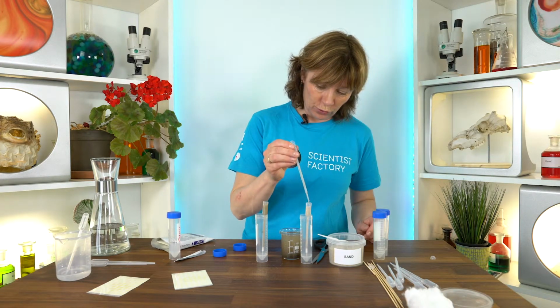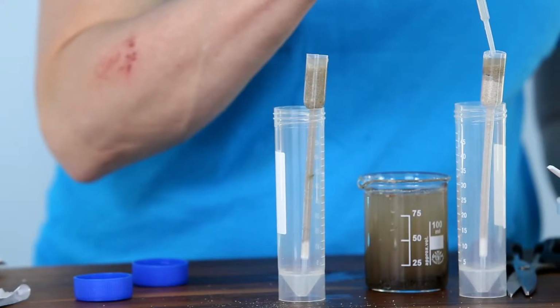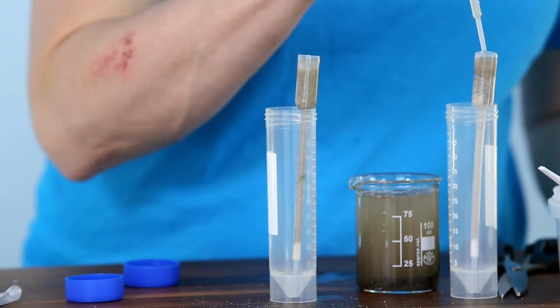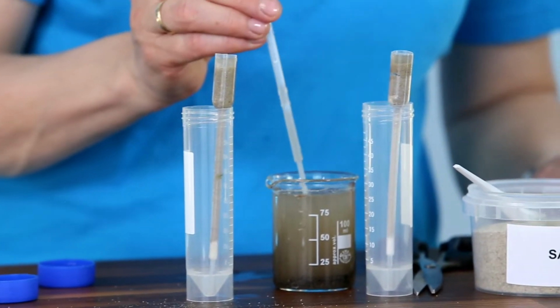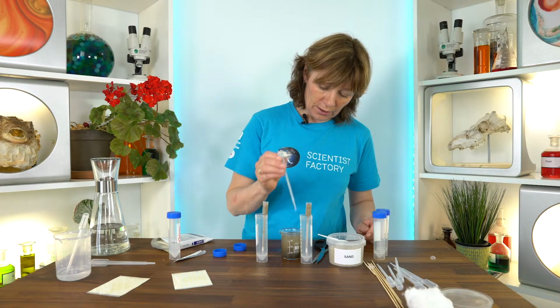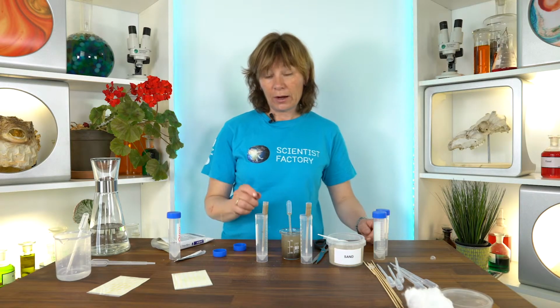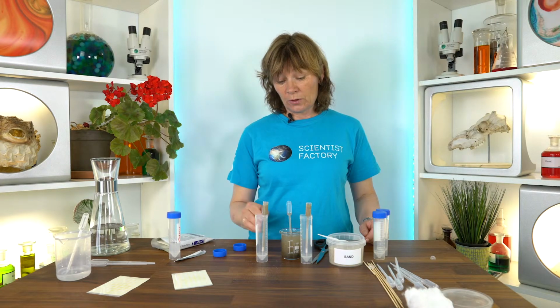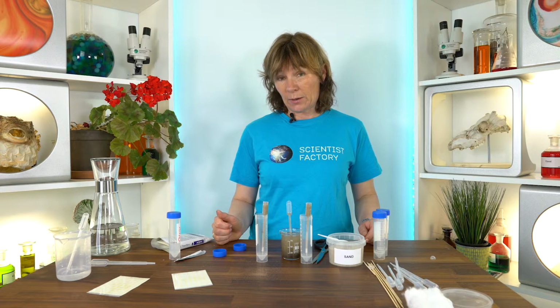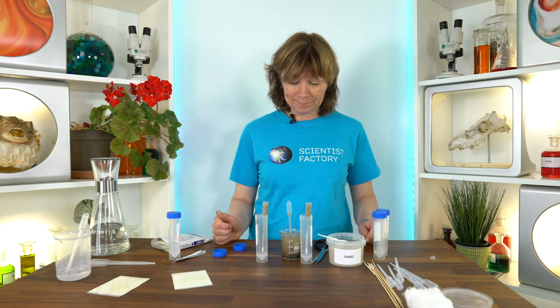But I will now make 2 samples with the same type of water and the same type of column. And then I will check if I add chlorine to one of these purified waters, how that affects the amount of bacteria.